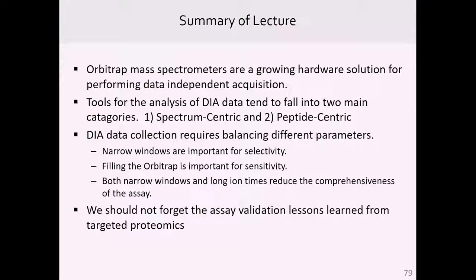So in our lab, we settled for a long time on 3 to 4 hour digestions. That was because we just got more DDA IDs at that point. And because of that, we just stopped. We didn't think about whether or not this actually gave us good quantitative data, because all we were focusing on was a bigger list at that point in time. Once we started looking at this much more in a targeted type analysis, we did find that longer digestions were better.